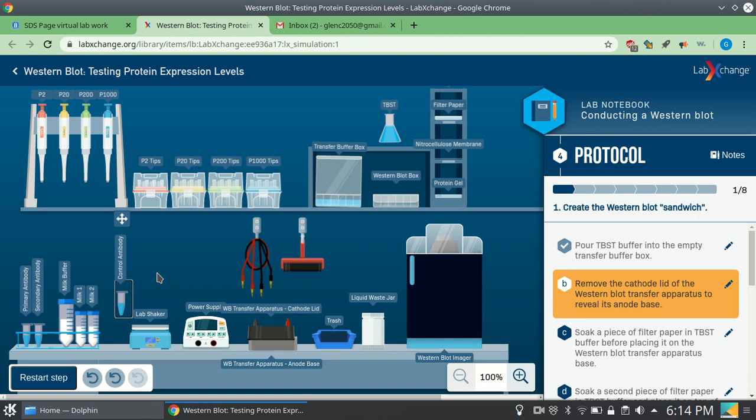The edits are supposed to remove a protein that is useful for the HIV virus to infect. So presumably, if you don't have the protein, you cannot be infected by HIV. The edits are done by CRISPR-Cas9, which is a new technique that recently won a Nobel Prize, but it is not important for the lab portion of our course.